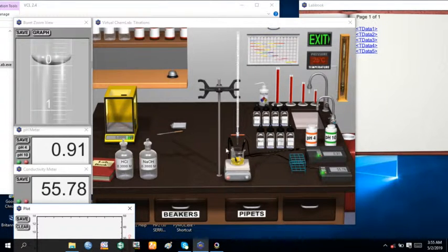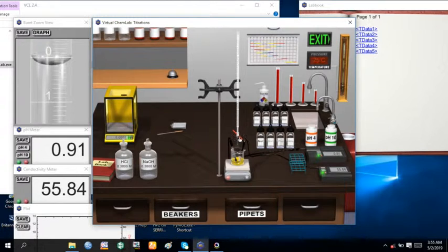Open the lab book, it is already open. Then you are going to run the titration now very fast. When the volume is up to 24 ml of sodium hydroxide in the burette, you stop. Remember, the HCl is in the beaker.